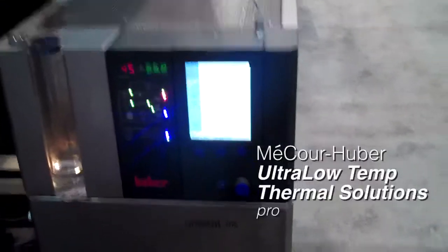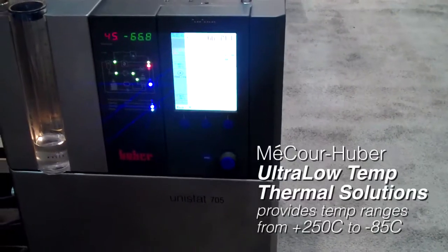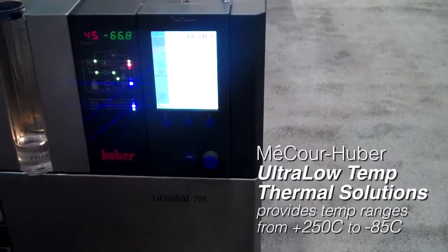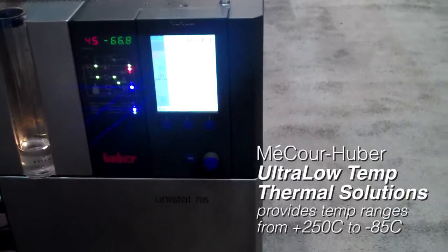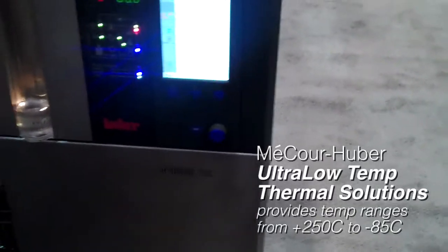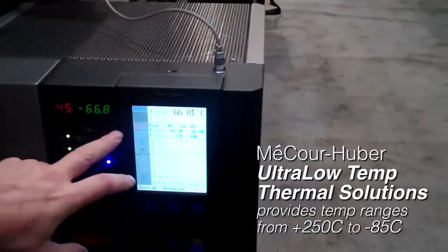You can see here on the touchscreen display, we're currently running a program that will allow the operator to do controlled freezing and controlled rate thawing. We can see here the internal temperature of the fluid that's circulating around the thermal block. This is the fluid that heats and cools the thermal block according to the customer's specifications.